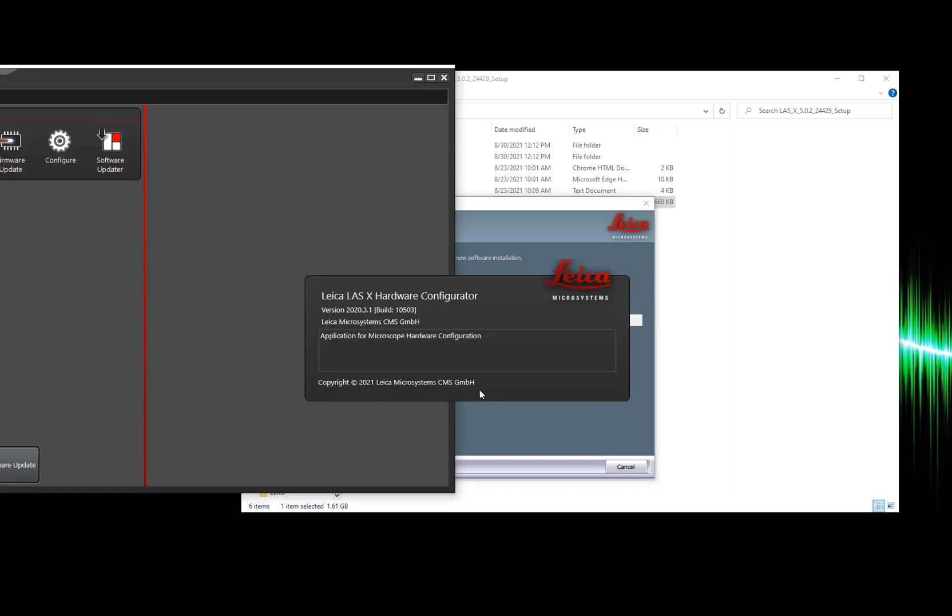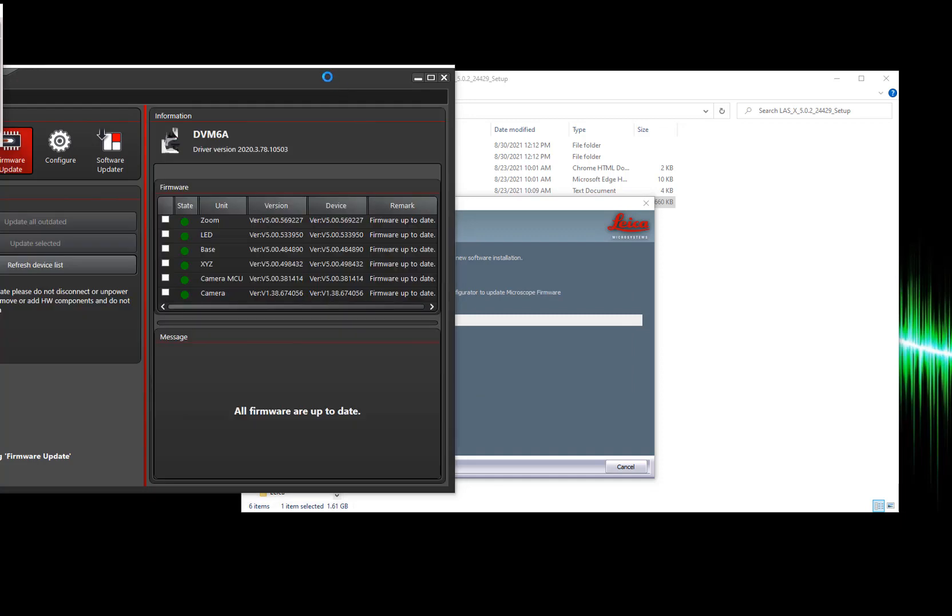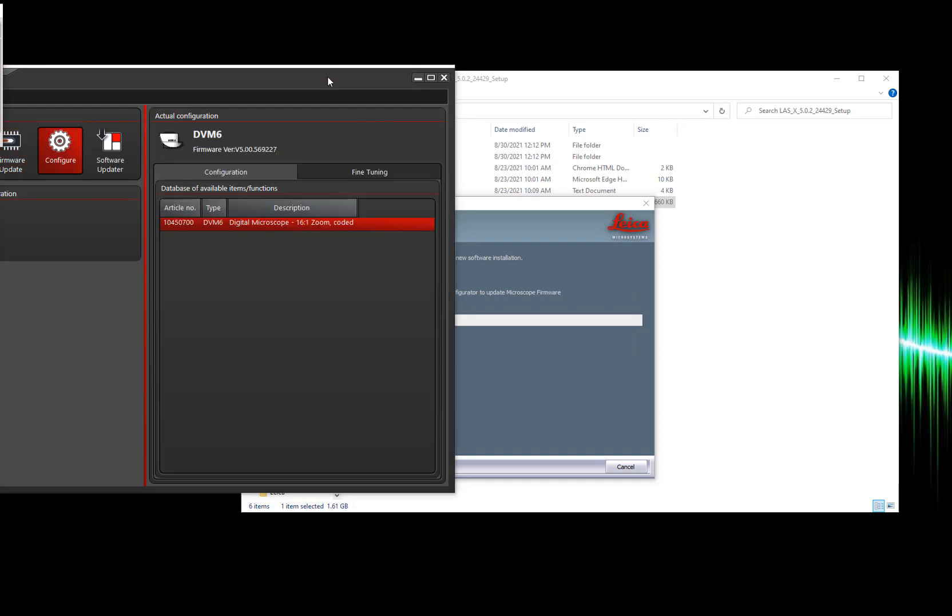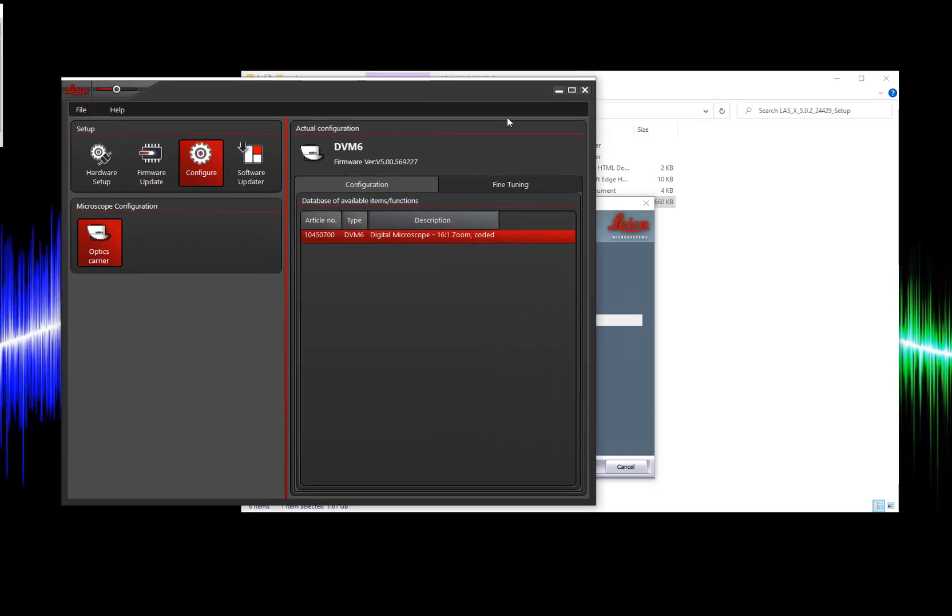If you don't uncheck the firmware update box from before you can simply close this window and we can update the firmware at the end.